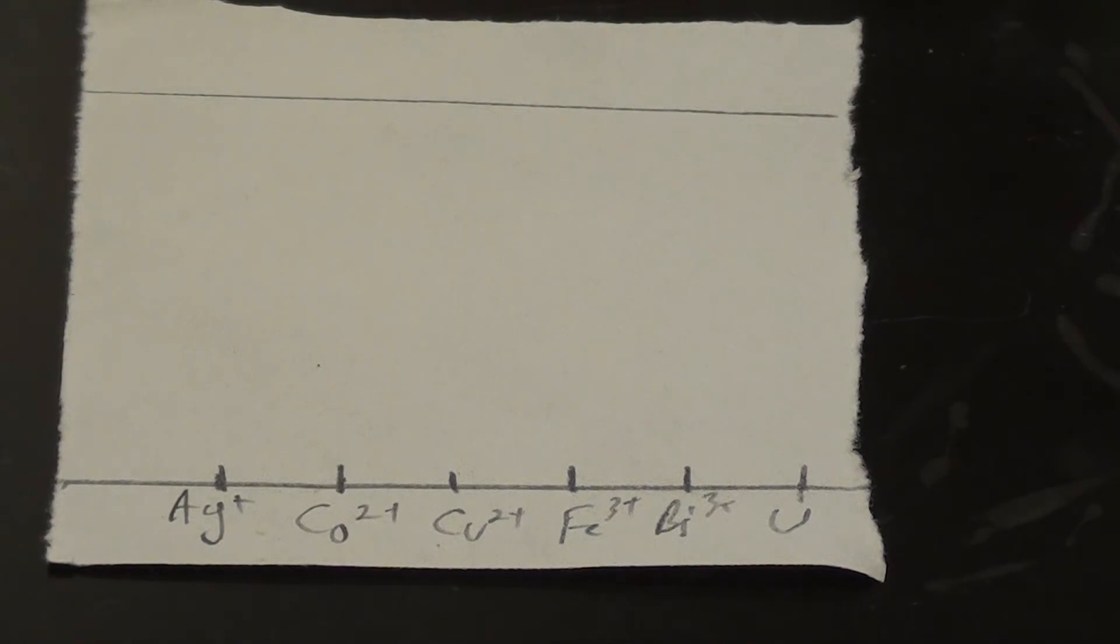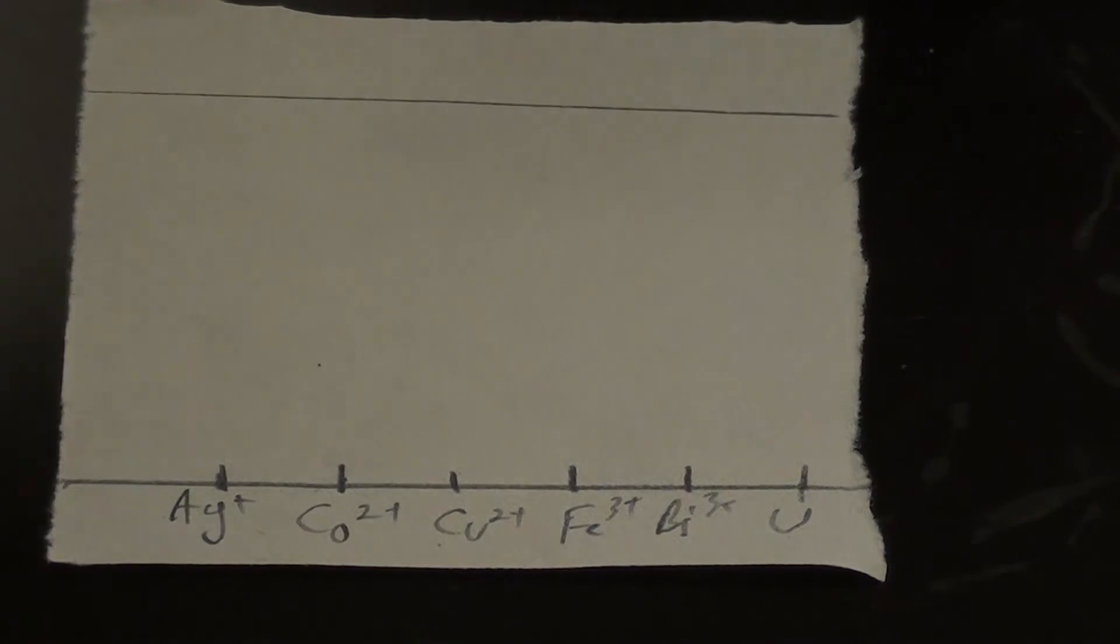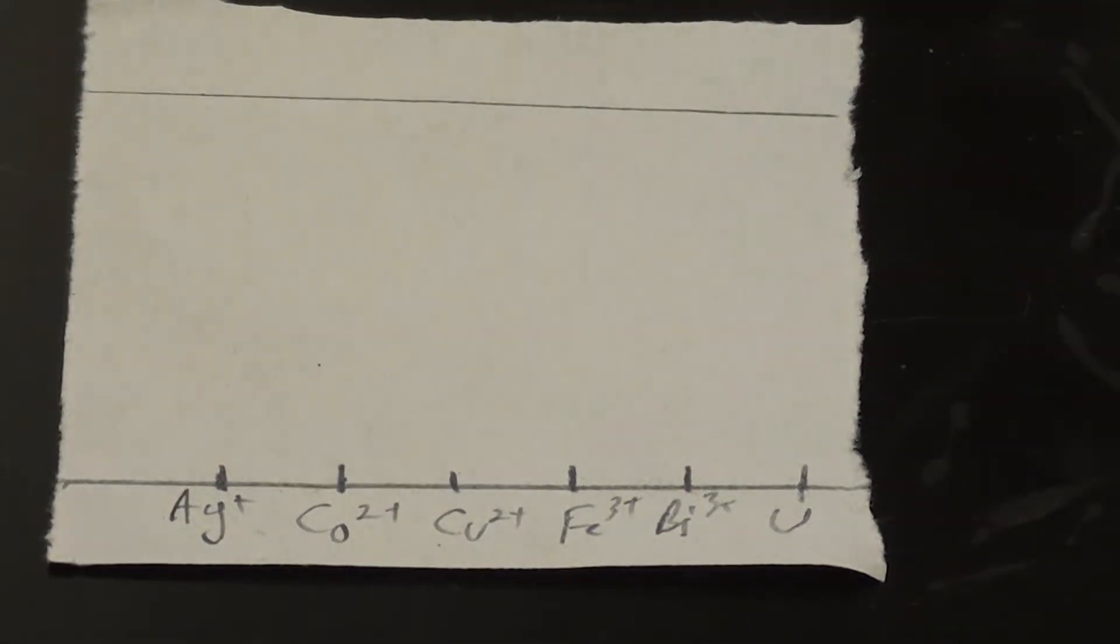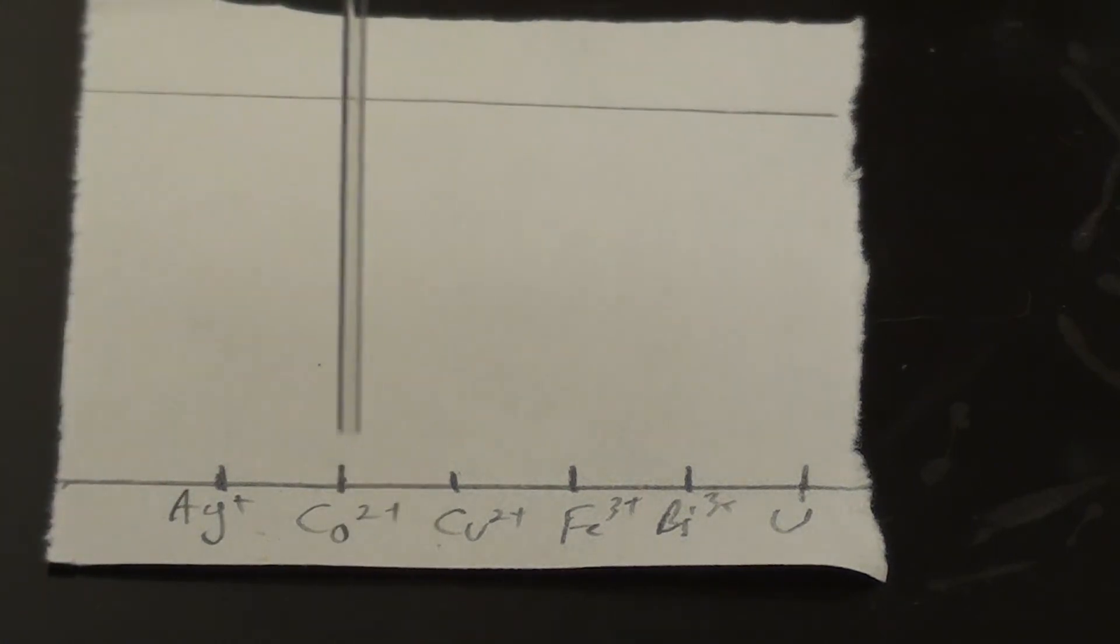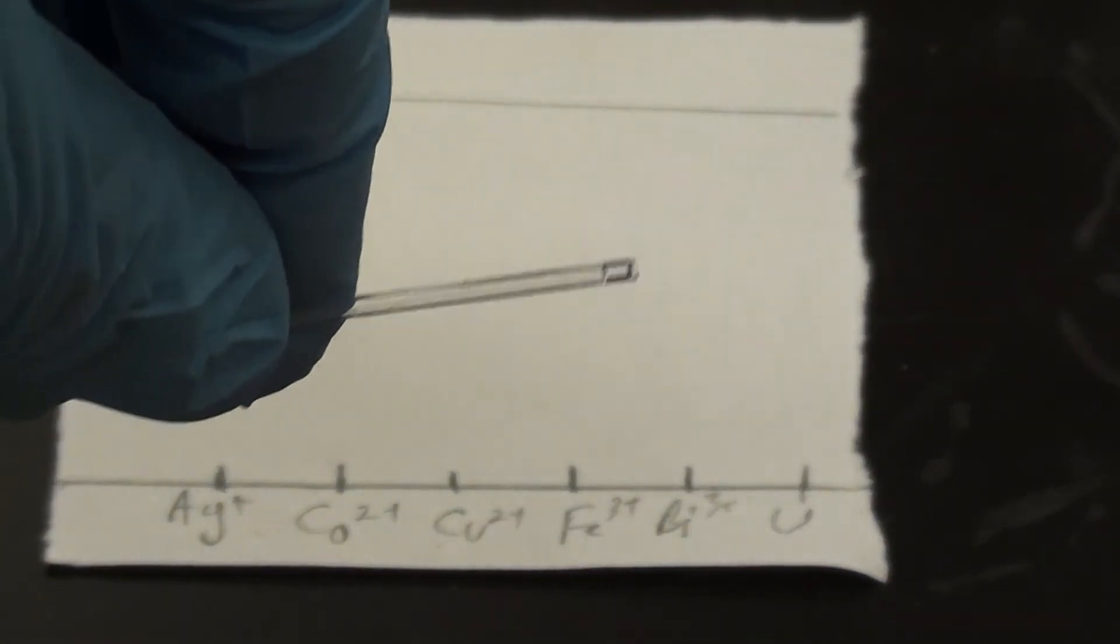Now what I'm going to show you is how we actually spot the plate or TLC paper. And what we're going to be using here is what's called a capillary. Now a capillary is a long thin tube, it's open at both ends.